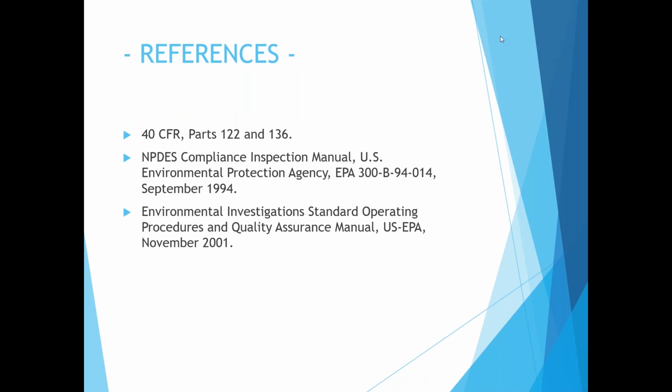And let me correct myself here. I believe I mentioned you can't transfer it. You can transfer volatiles, I'm sorry. You can collect those in a bucket. Just be really careful and don't cause any turbulence. But preferably, you want to collect those in the container that they give you, because again, those are those 40 ml vials for the volatiles.